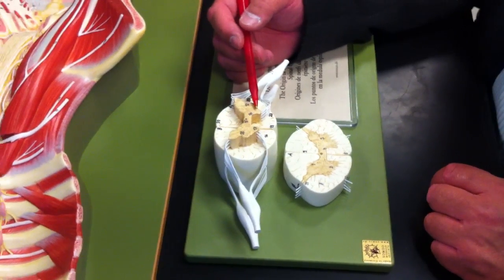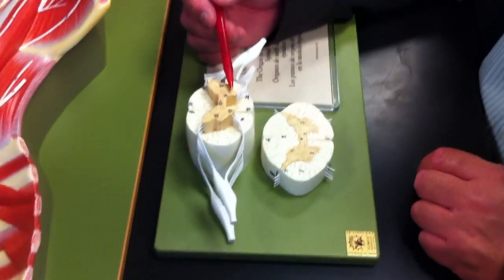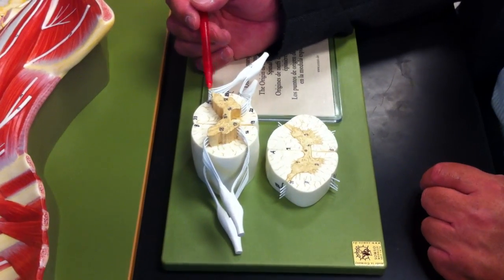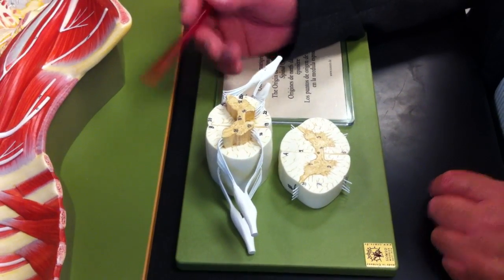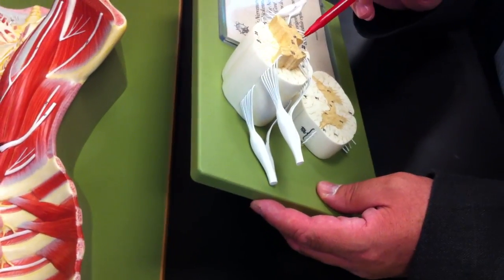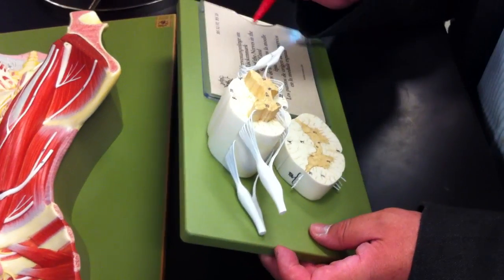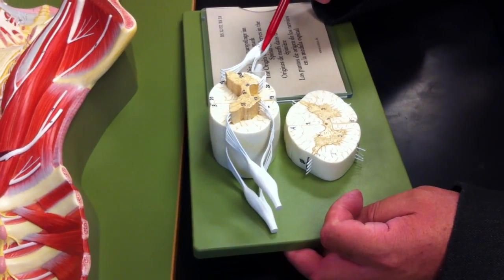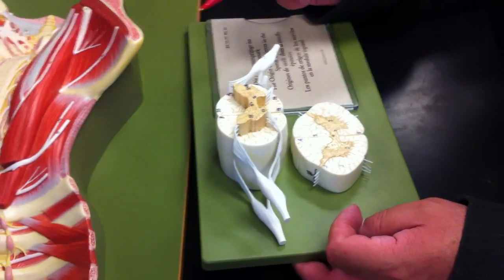How can we tell that? Well, on the one hand, I told you that the anterior horn doesn't reach the edge, and the posterior horn kind of reaches the edge, right? But it's kind of borderline, this one. Well, this one is pretty clear. But the most important thing is identifying quickly the dorsal root ganglion. There is no ventral root ganglion. There is no such thing as a ventral root ganglion.